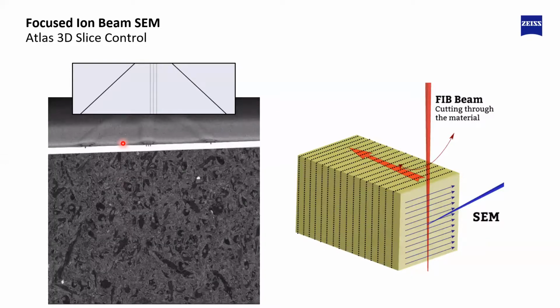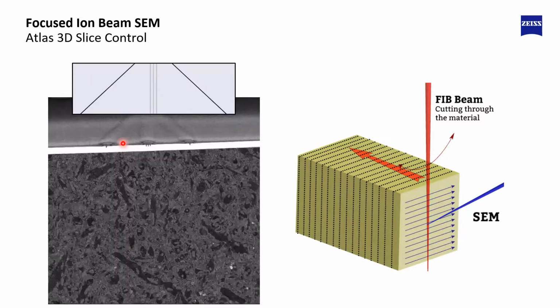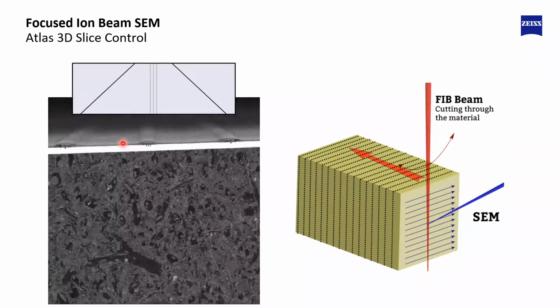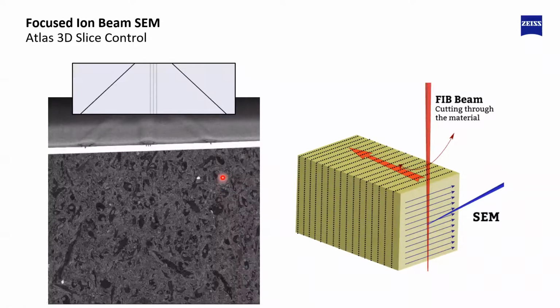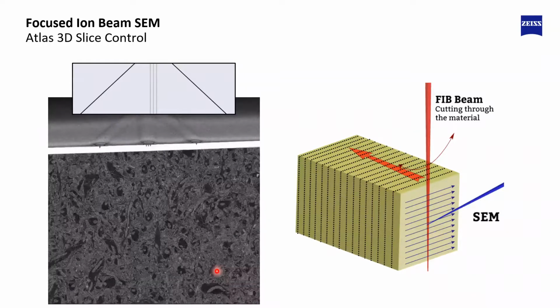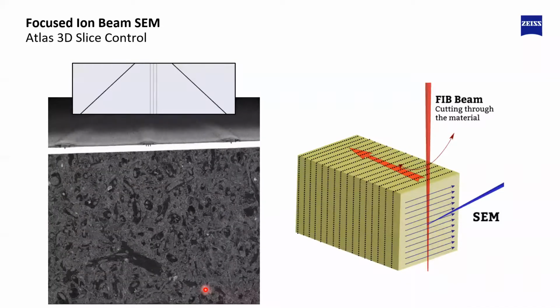And why is that important? Well, our focused ion beam is not always that precise. Meaning sometimes it's milling away material faster, sometimes a little bit slower. So this here is a feedback loop that allows us to measure exactly how much the focused ion beam actually mills in. And down here, I hope you appreciate that this is again inverted neuronal tissue that we image, with all those bright spots. The round ones are mitochondria, the dark ones are probably big dendrites, etc.